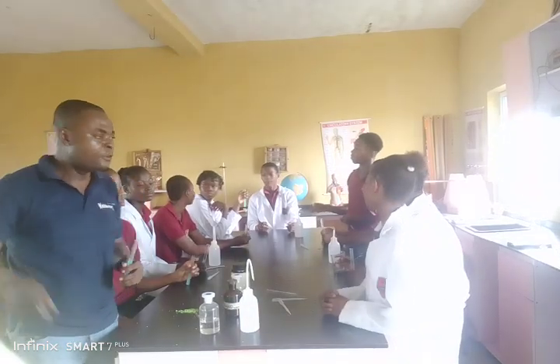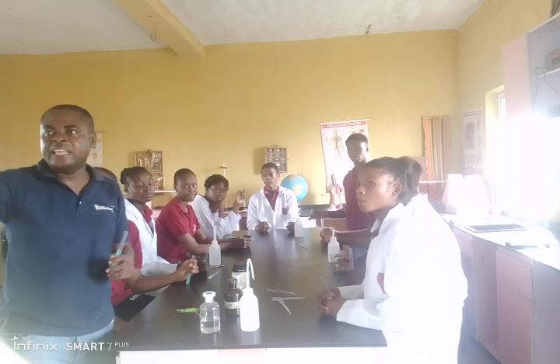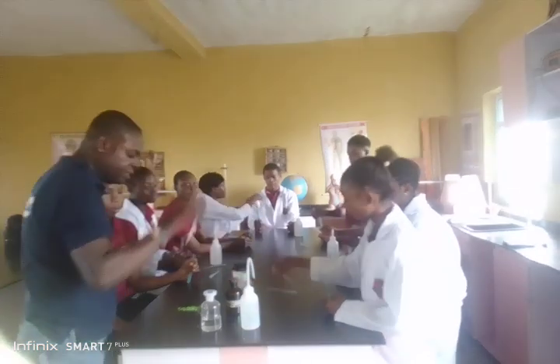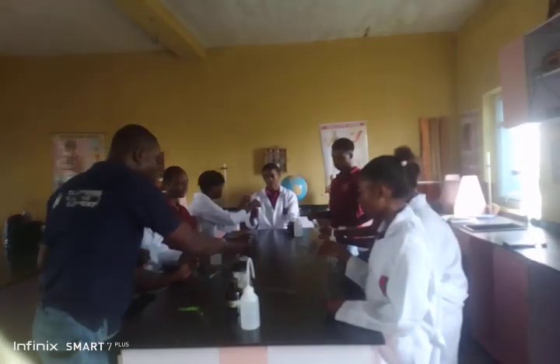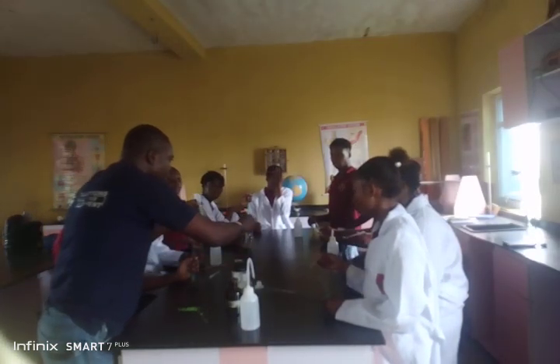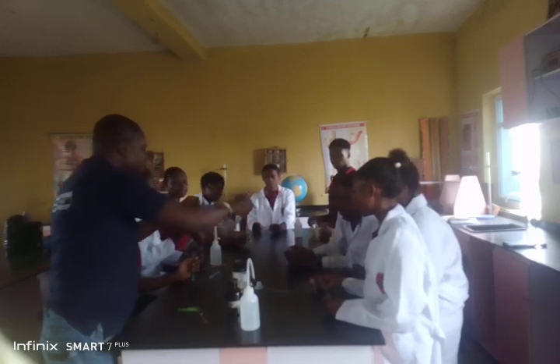To the first portion of solution C, add ammonia solution in drops. This is ammonia solution. You are going to use your dropping pipette. Now look at what I'm doing, in drops. Little drop.